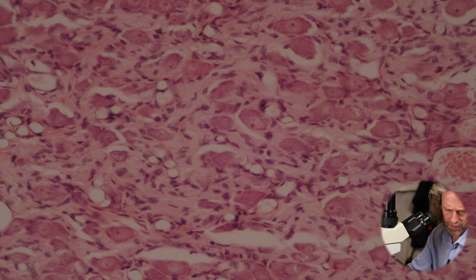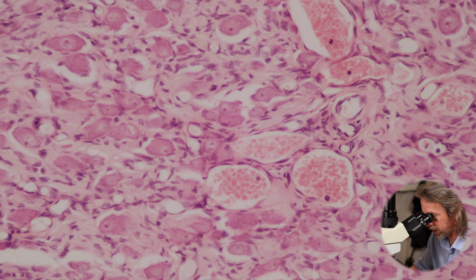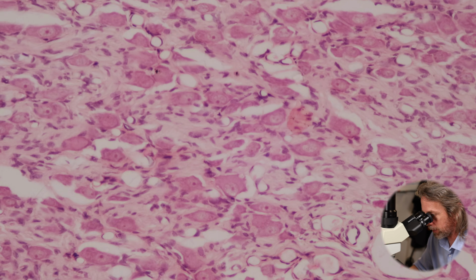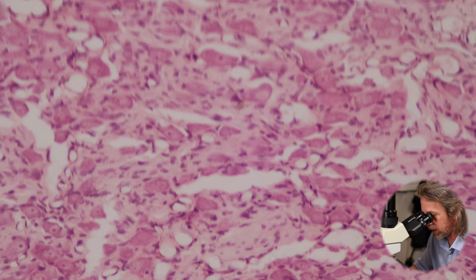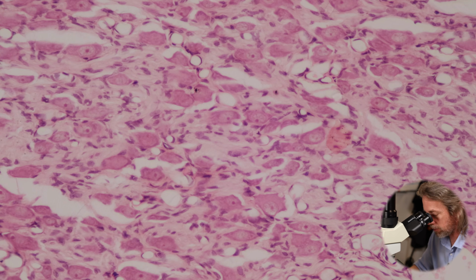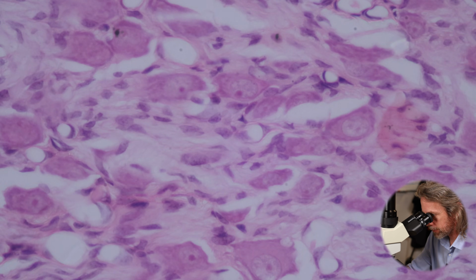Are you starting, might help if I brighten it up, right? Are you starting to see some of the cells in here? Again, we can see blood vessels. You can see why we did blood vessels last week, because we see them everywhere, right? Because they get everywhere. So we've got a lot of open circles there. We've got some artifacts again where things have come apart. But are you starting to see some big cells in there? How about now?